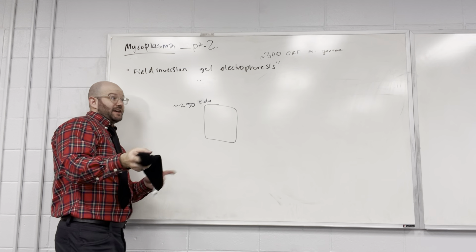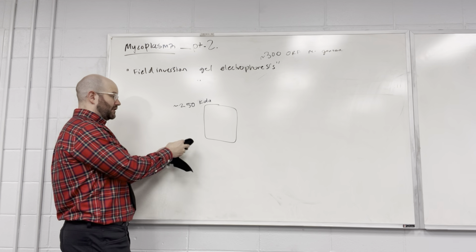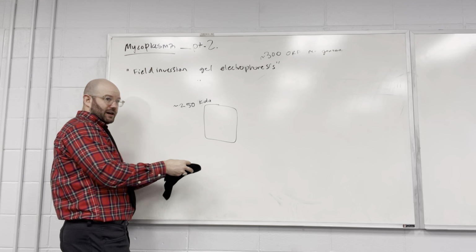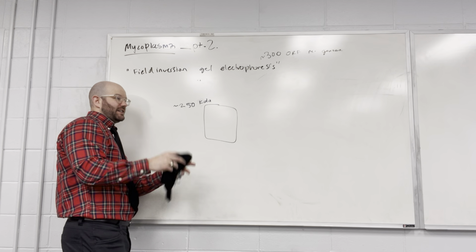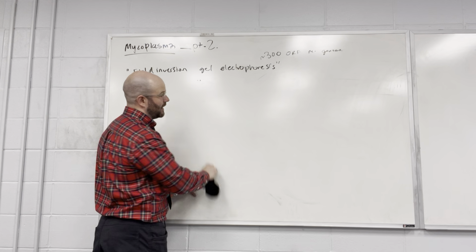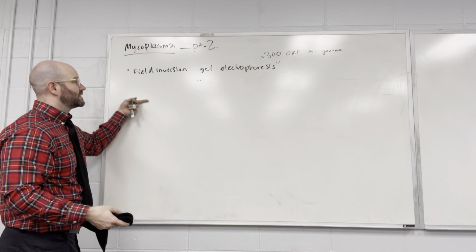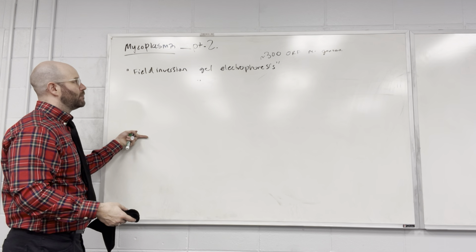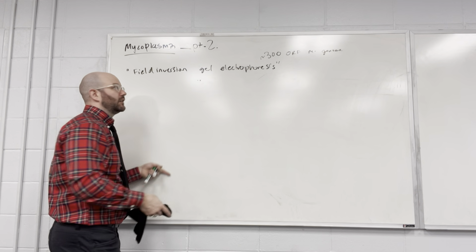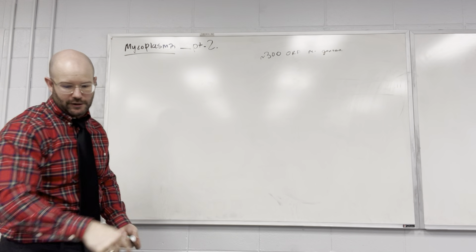Well, in that case, you can do non-denaturing PAGE, where you can electrophorese things that are in complex, but it's a non-denaturing gel, so you can't add SDS. So yeah, there are definitely subtle modifications to PAGE for proteins, although it's going to be a little bit different because most proteins can be separated by size in a normal PAGE. Unless you may be running complexes or something.